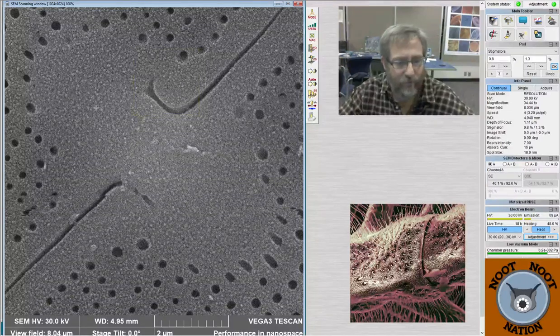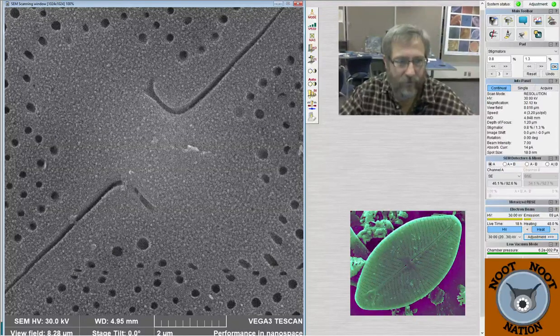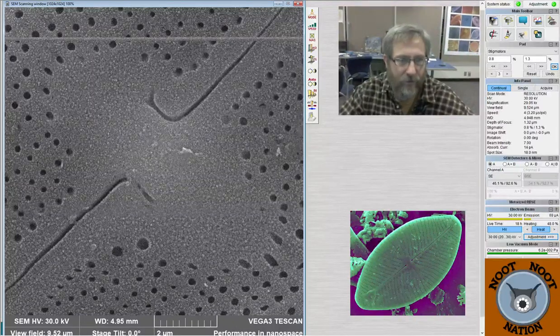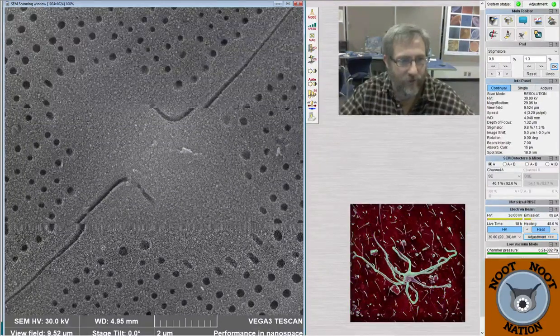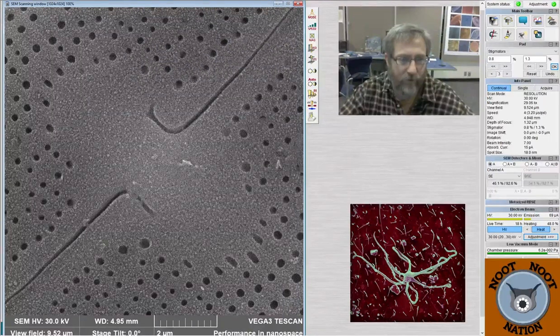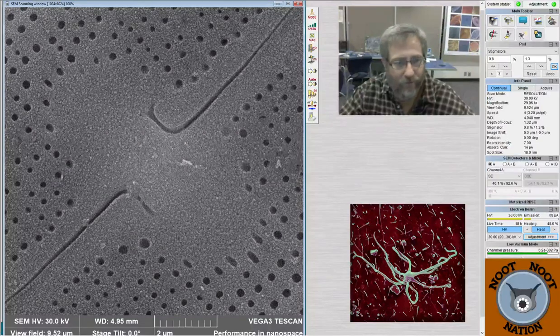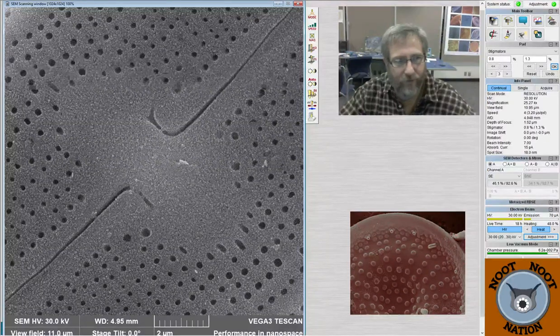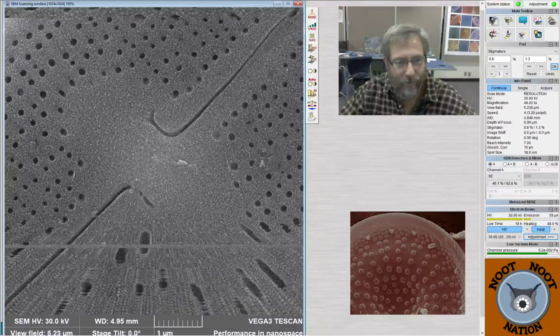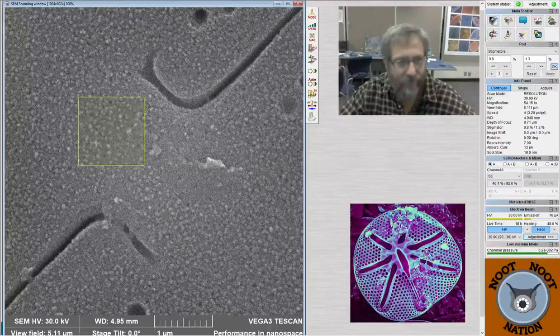These are some samples from Clear Lake, and we were talking a little bit last night. Pandemic Watch, I think, was looking forward to seeing a diatom where the proximal raphe ends were going in opposite directions like this, and I said, "Oh, that's the genus Neidium that has that characteristic." So I just jumped around really quickly to see if I could find a Neidium. And it wasn't that hard. They're in the sample.